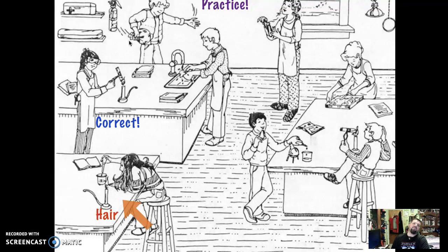Let's take a look around the room and see what else. This young lady is very correct. I want to point this out because she's actually doing a very good job here of heating her test tube. And she's pointing it away from herself and she's got the proper clothing on. So she's doing a really good job. How about this young man here? Following her right there. Yes. What's going on here? Well, this young man here is horse playing. Horse playing is never allowed in the lab. That can lead to accidents. That's a no-no. Let's follow the next student and see what we can see. This young man here is correct in his procedures because he is washing and he has his lab apron on.